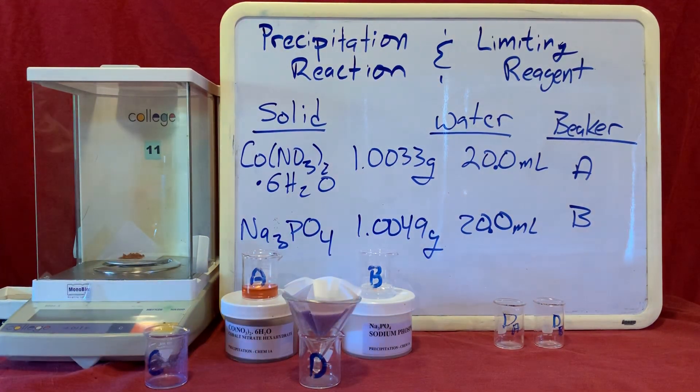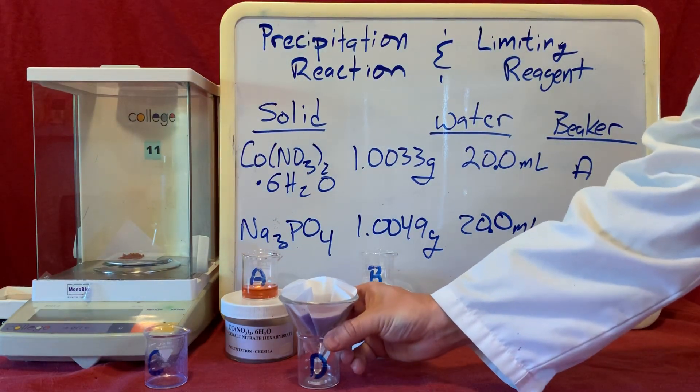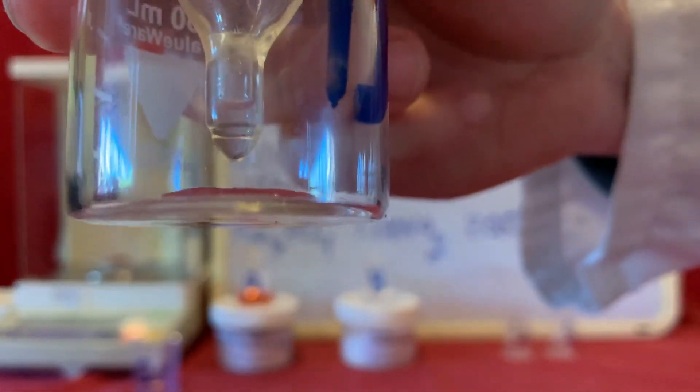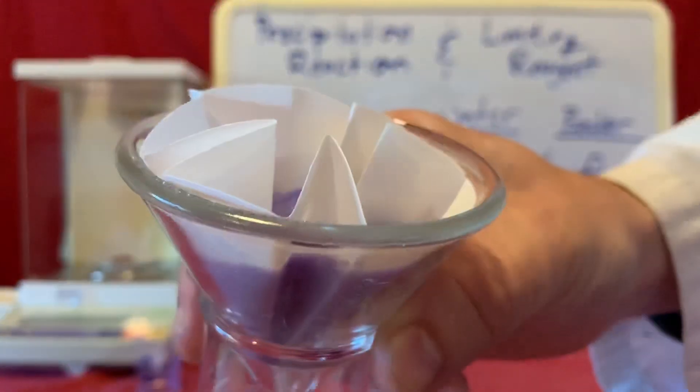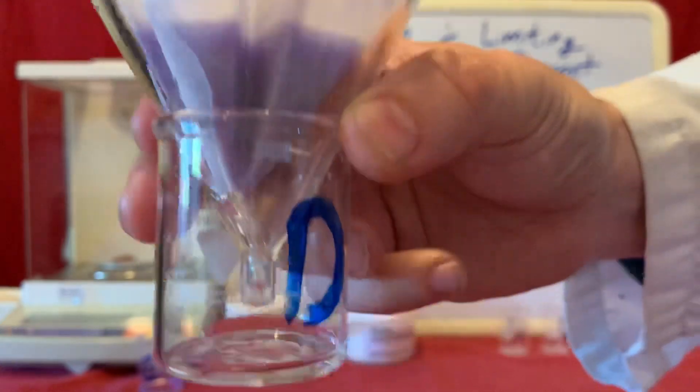So now the mixture begins to separate. This process can take some time letting all the liquid drain past the solid through the filter paper. You can see this happening down here on the bottom as the liquid slowly drains out past the filter paper. You can see it waggling around in there.